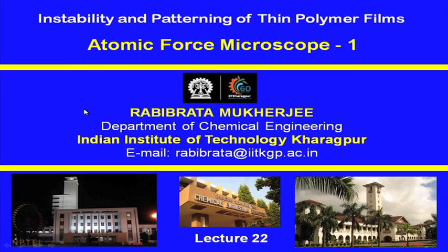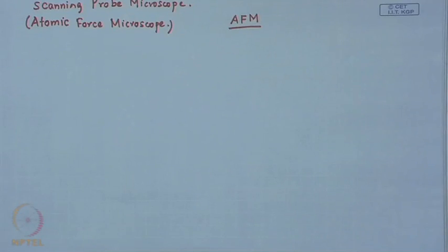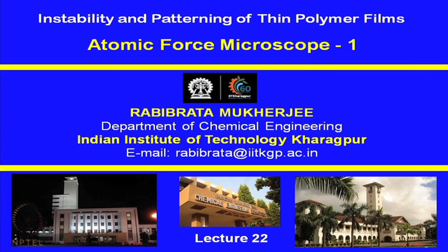Welcome back. We now change gears a little bit and start talking of something slightly different. As you can see from the title of the lecture itself, we are now going to talk about the atomic force microscope. I do not know how many of you are aware of this name, atomic force microscope, or the AFM as it is commonly known.